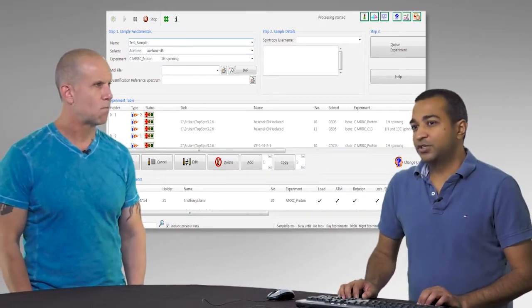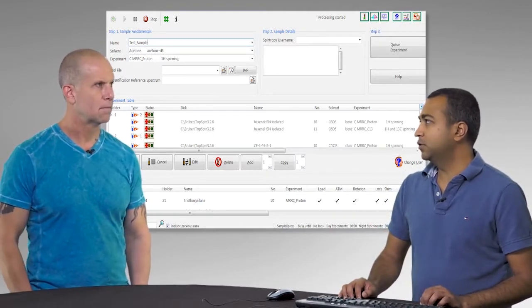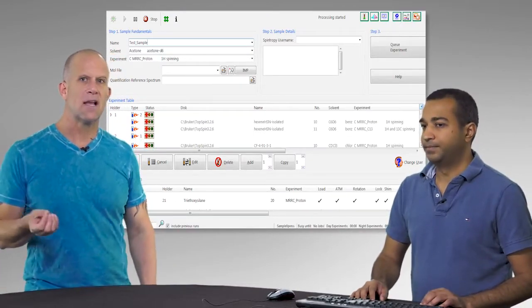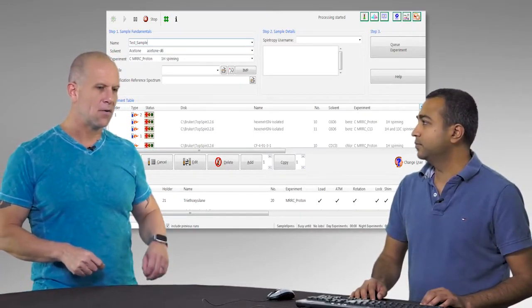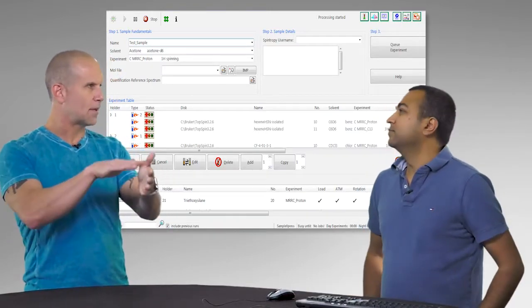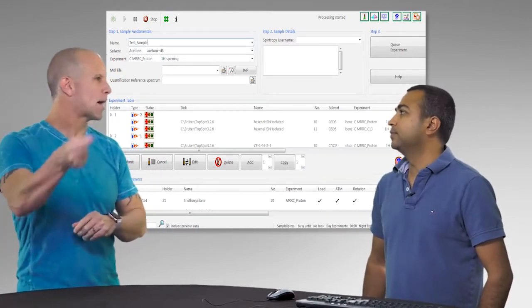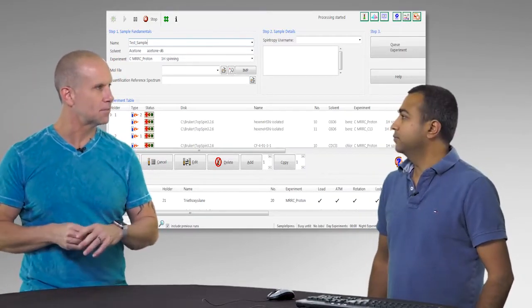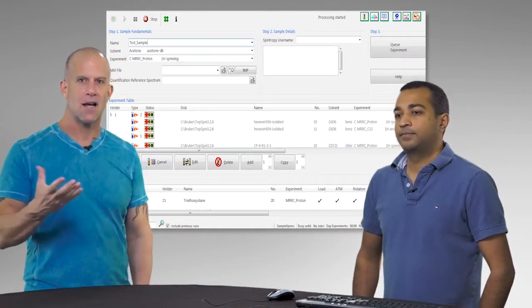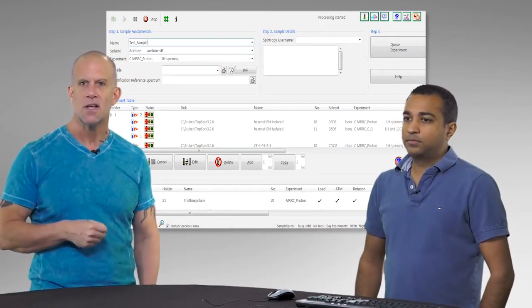Yes, there is actually, and it's fairly long. I want to say it's about 100 characters. So you can enter kind of long names in with spaces. I guess by default, I always think of using one continuous thing with underscores instead of spaces as being something that is more backwards compatible with a lot of systems. Yeah, exactly. So you have your test_sample, but it could be, like you said, any name you want under 100 characters. Then you move on.